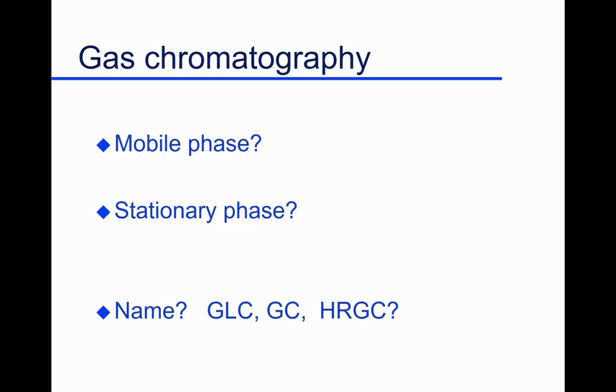So let's go on. I get the fun of talking about gas chromatography. You've had the fundamentals of chromatography. You're working on LC at this point, liquid chromatography. And I think some of you have also had the laboratory at this point on gas chromatography doing fatty acid analysis. Probably not everybody, right? Just as a rotation lab. And so we'll give a little bit of fundamental and then a little bit of practical. How's that? If you look at gas chromatography, what do you expect is the mobile phase?